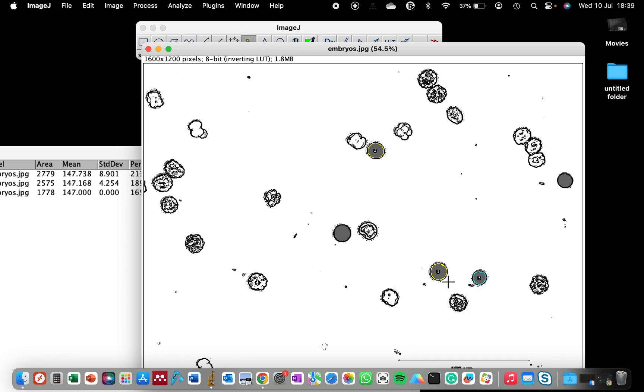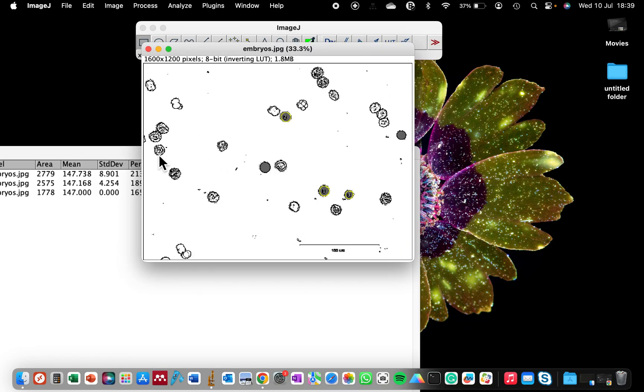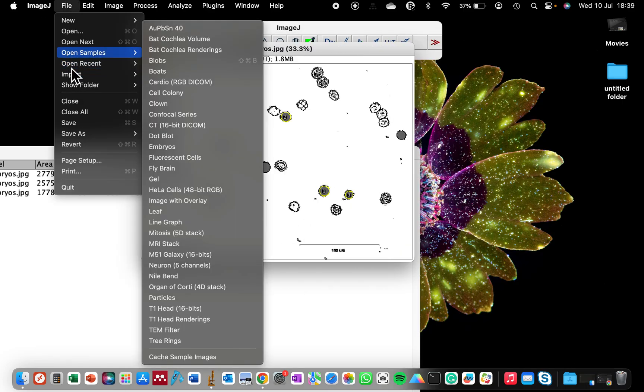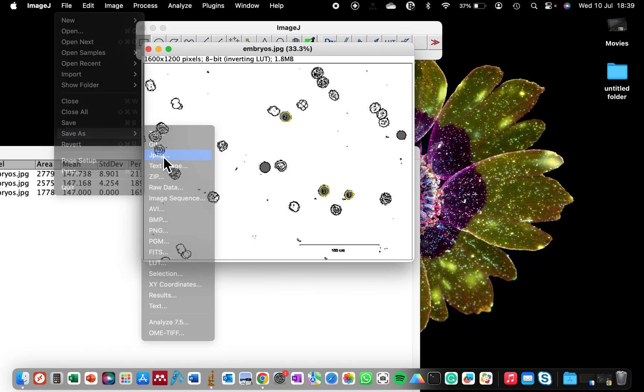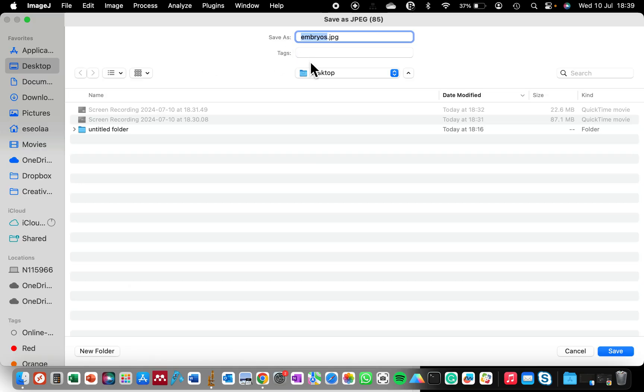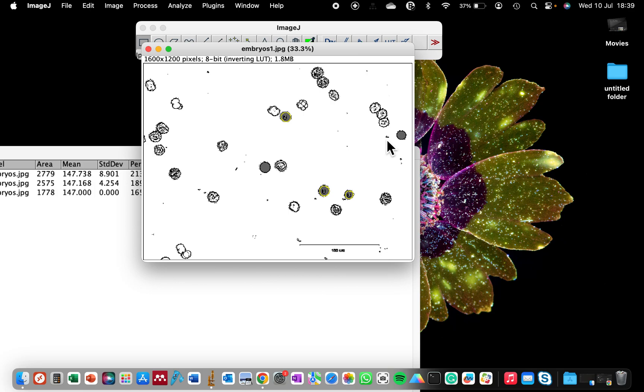So that is it on how to fill a particular area of your cell for analysis. And now we can save this image. File, Save As. You can save it as JPEG since the original image is in JPEG, and we save it as embryos number one.